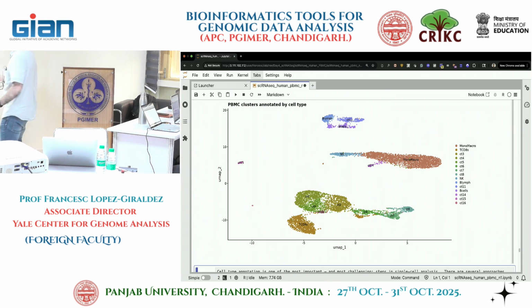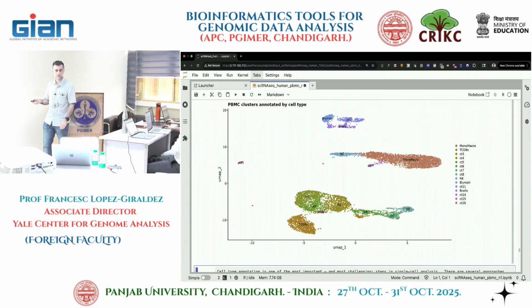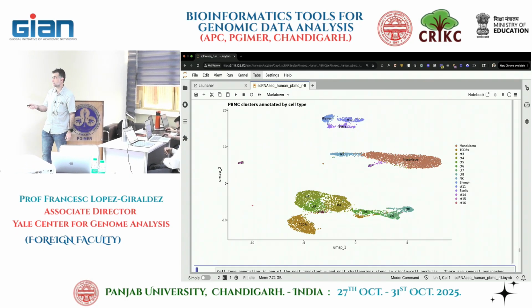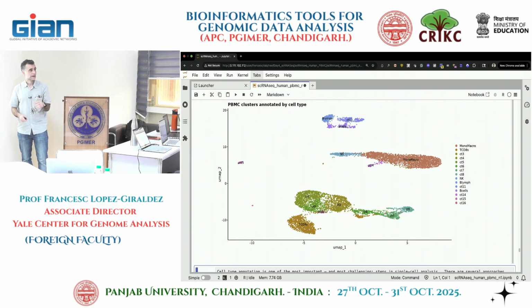So now we merge a cluster, right? We don't have those two clusters that we had here, it's only one. We probably merged something down here, right? Those clusters that we merged, the CD8s, got merged. This is quite common. Again, our clustering doesn't need to represent cell types directly. It's not one-to-one. It depends on a lot of different things. If you want to subclassify the T CD8s, you could use those two separations that we created. But if not, we could merge them. Questions?